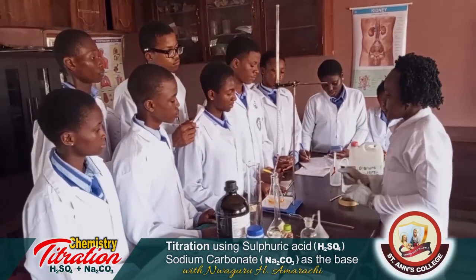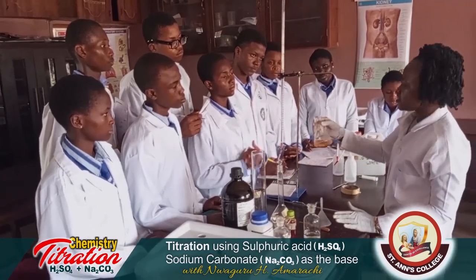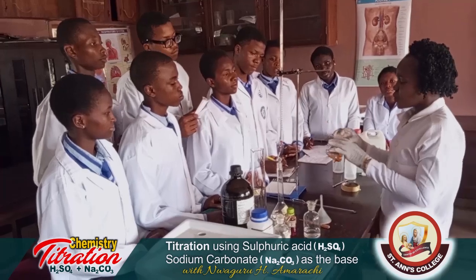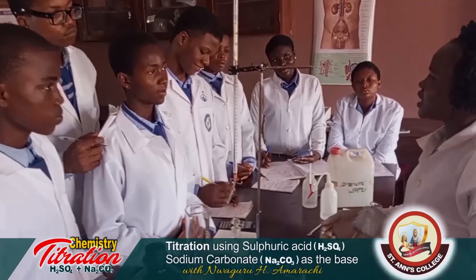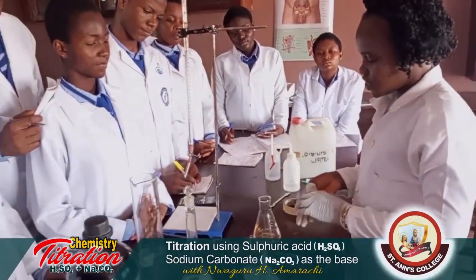We always say acid and base in neutralization gives what? Salt and water. Can we check whether this is actually giving us salt and water? Okay, let's check.